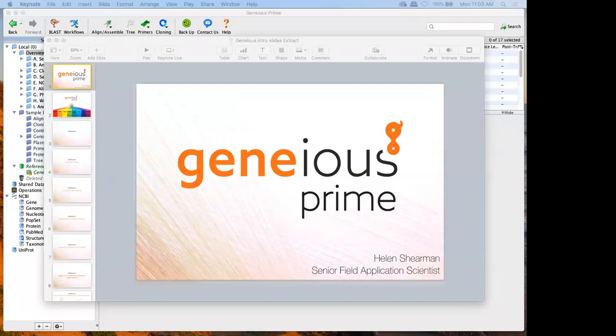The other thing I'll mention is I do like to keep these sort of informal. I know we've got a large-ish group, but if you've got any questions as I go, let me know. Either speak up. I'll try to stop periodically for questions. You can also speak up as I'm going, or let me know through the chat function, and we'll keep an eye on that. But with that, I've got just a couple of slides to start out with, just to tell you sort of what Geneious is, particularly for those of you who may be a lot newer to it, and some of the basic background information. And then the rest of this is going to be a live demo.